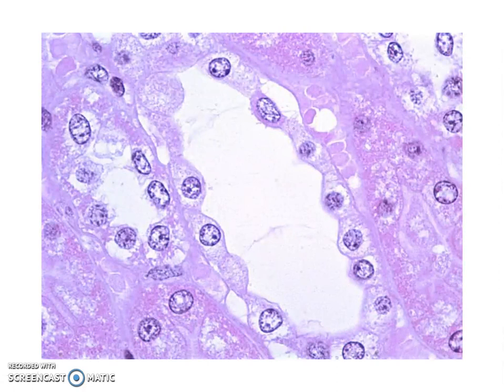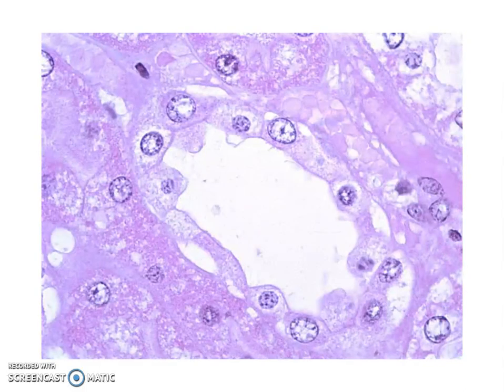And when we look at the next slide, we're going to zoom in a little bit. And lo and behold, here is our lumen, and there is a single layer of cells surrounding the lumen. Let's look at the shape of these cells. This cell here is pretty flattened. This cell here is pretty flat. In fact, it bulges out a little bit around this big dark staining nucleus here. And most of the cells here are pretty flattened. And there's only a single layer of these cells. So this would be simple squamous epithelial tissue.